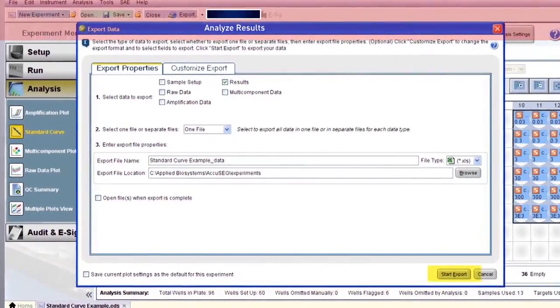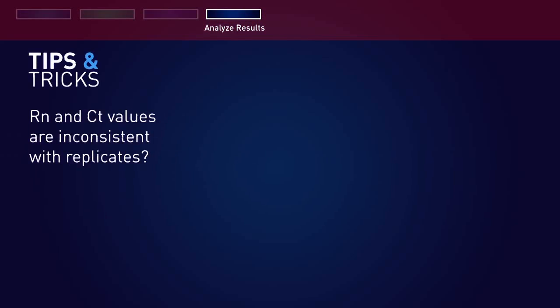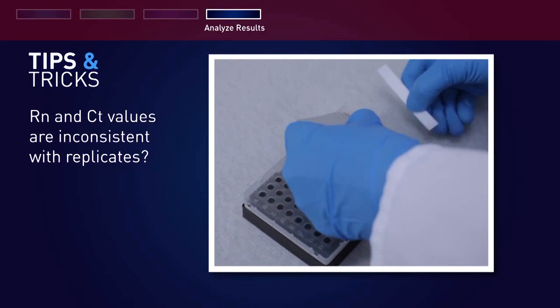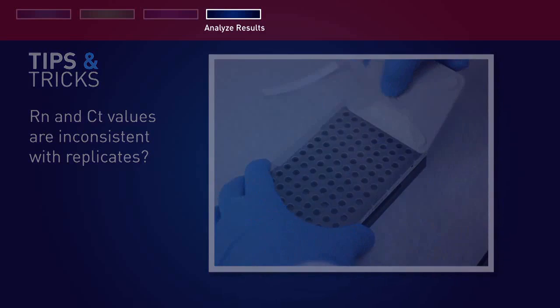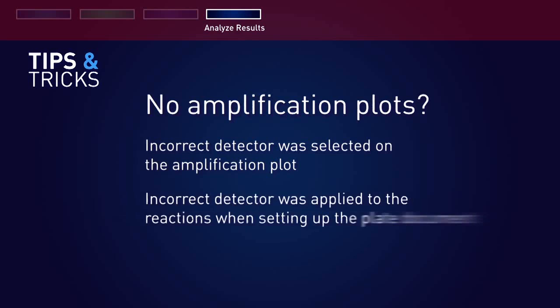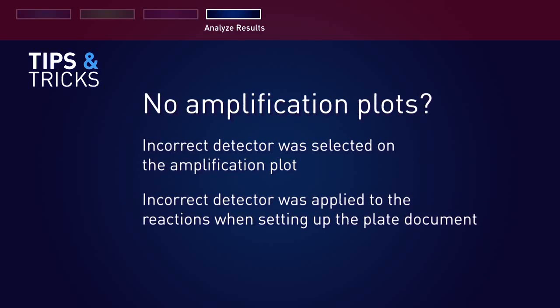If you find that the RN and CT values are inconsistent with replicates, it may be because there has been evaporation of reaction mixture from some of the wells, because the optical adhesive cover was not correctly sealed to the reaction plate. If you find there are no defined amplification plots, it may be because an incorrect detector was selected on the amplification plot, or an incorrect detector was applied to the reactions when setting up the plate document.